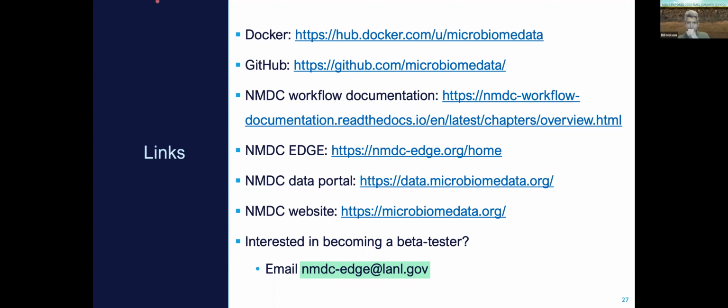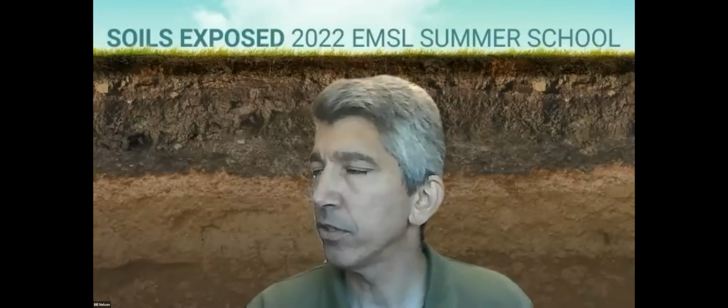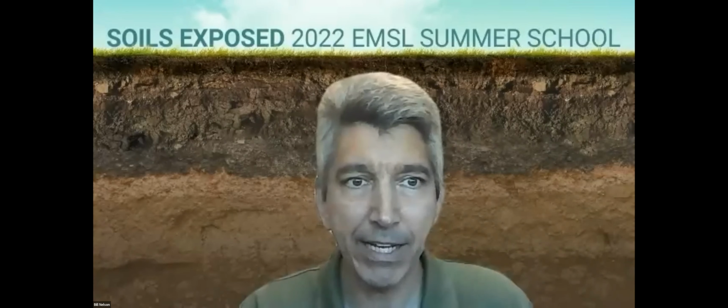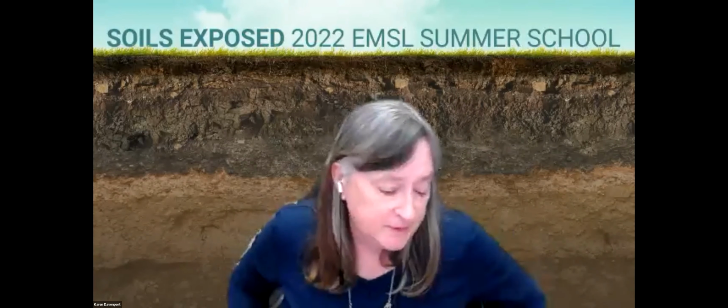Thank you, Karen. There are a couple of questions that have popped up. The first one has to do with input into the process. The question that was asked was, can a FASTA file be used for input instead of a FASTQ, I believe for the read files? Not at the moment.